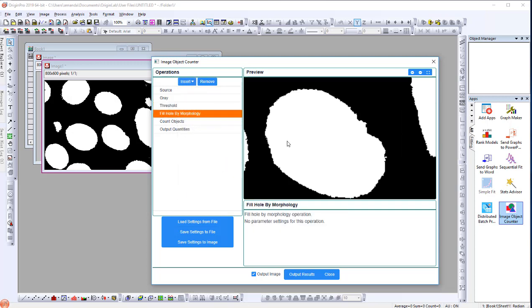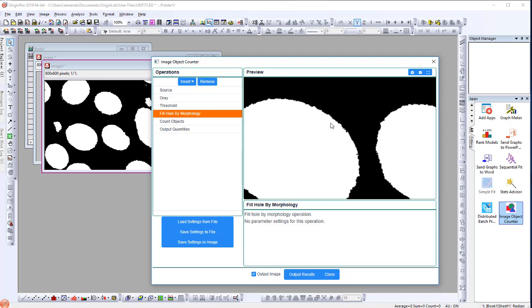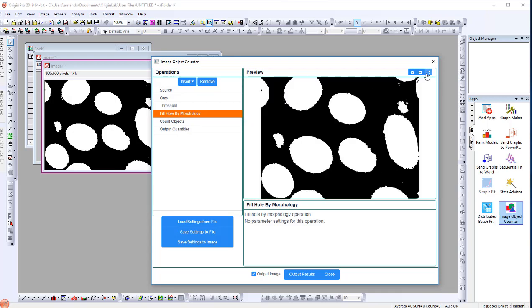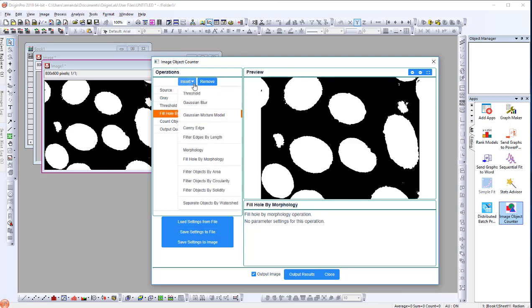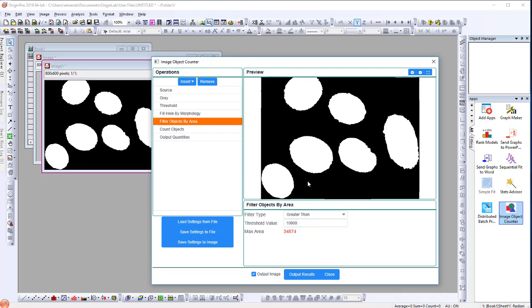Now, click the right-most button at the top right corner to fit the image. Now, we need to filter out the impurities and partial cells. Since the area of impurities is much smaller than cells, we can choose Filter Objects by Area. Let's set the threshold value to 10,000 to filter out all objects that have a smaller area than 10,000 pixels.